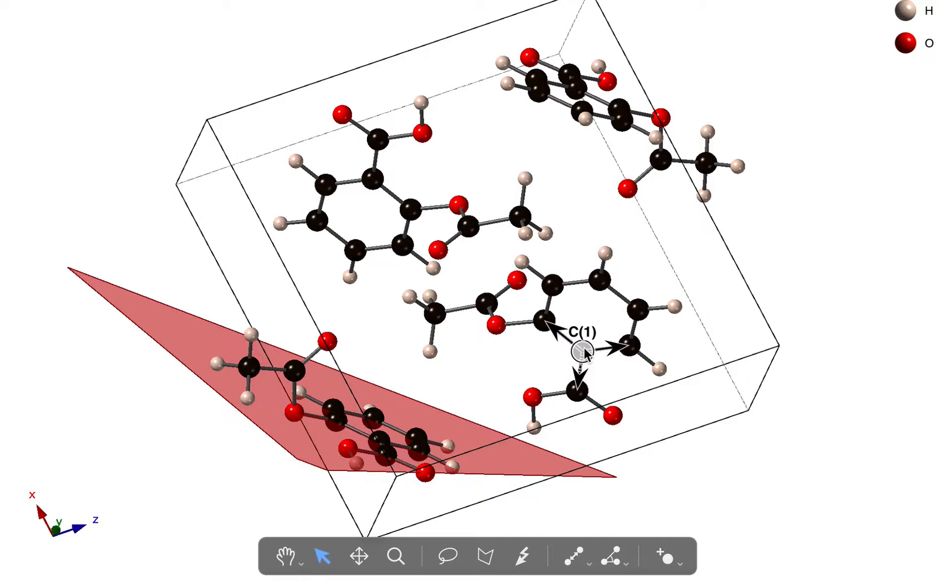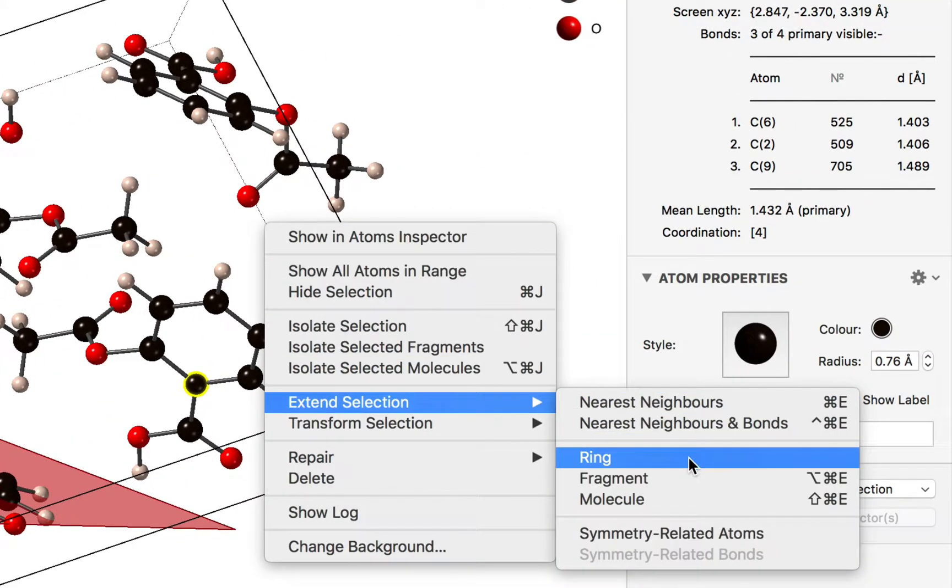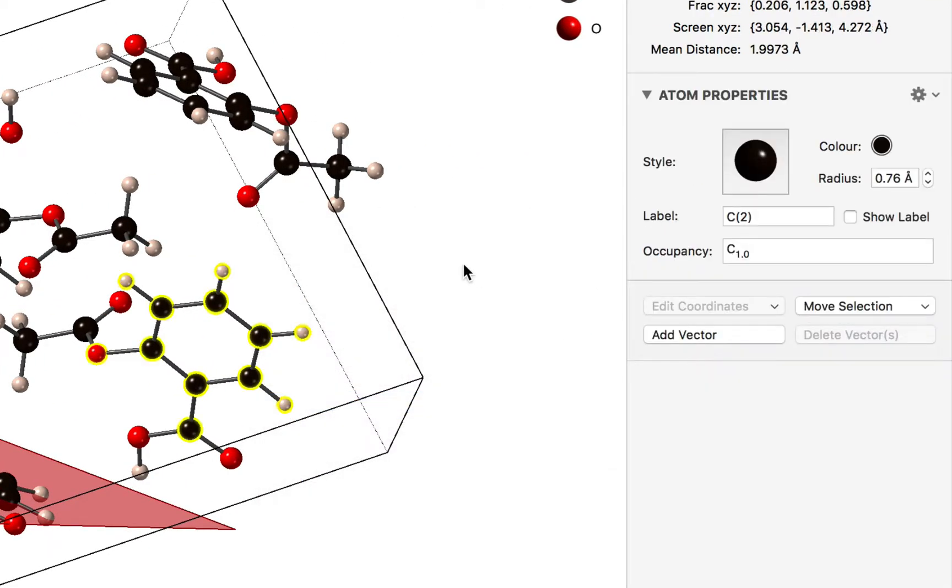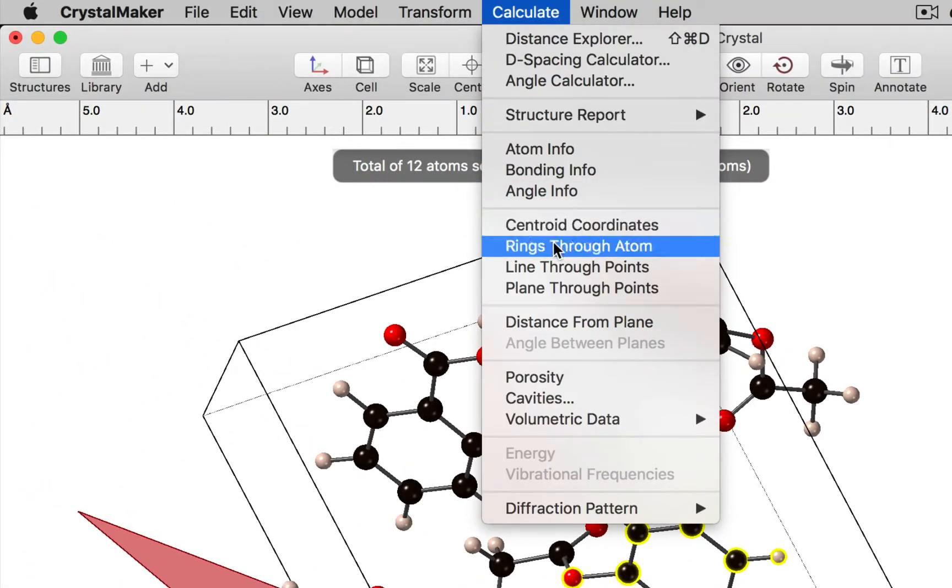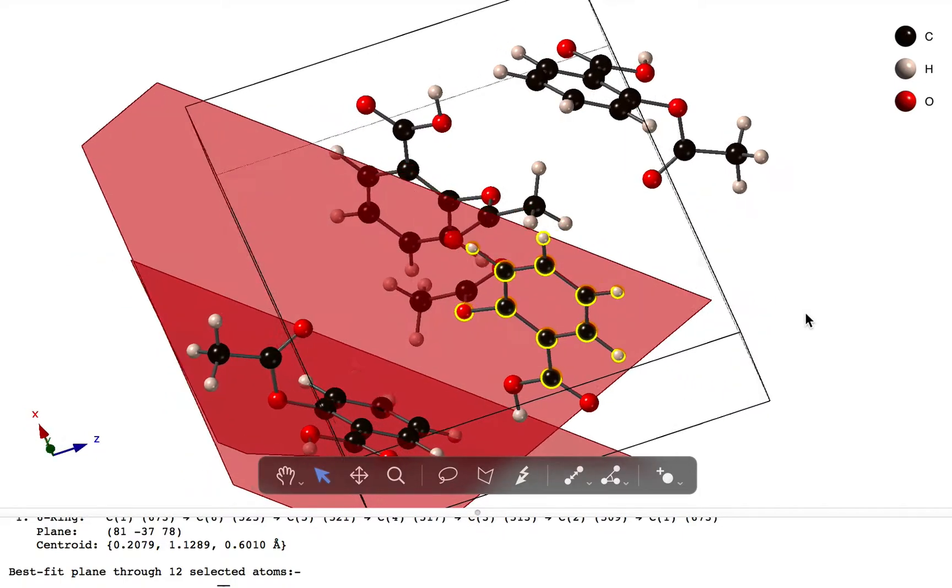So we're going to do the same things as before. Select a ring, we'll extend the selection to the neighbors, and we'll calculate the best fit plane through those points. Here we have that plane.